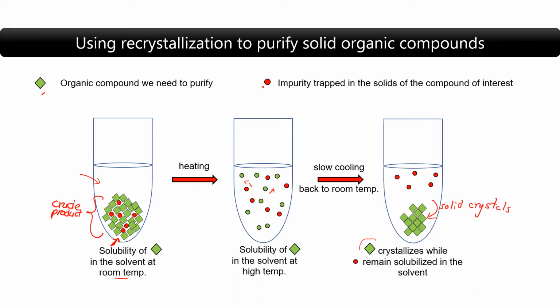And because this is a slow cooling, there is enough time for these green crystals to form strong bonds within each other where they have the best affinity and form a very structured crystal solid, leaving out the impurities in the solution.